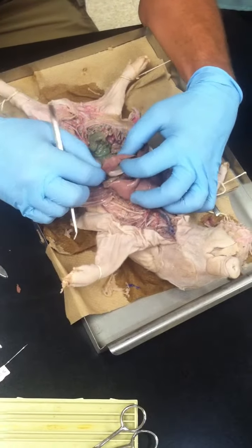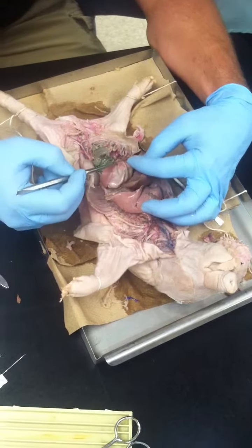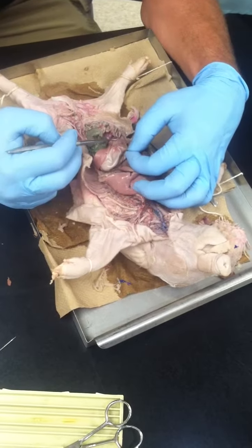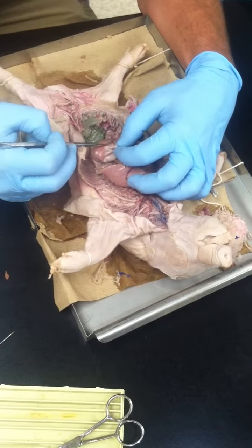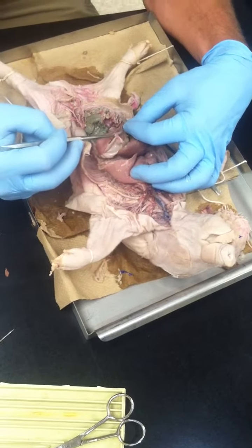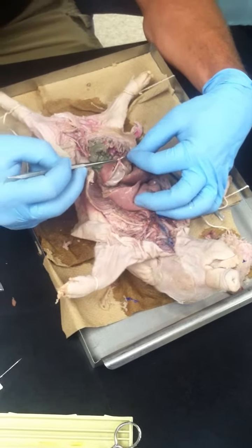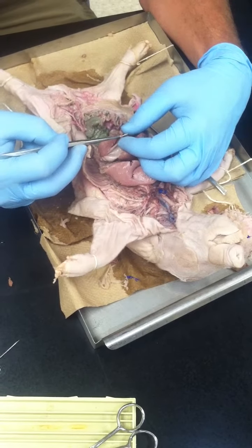Splenic, here's your spleen, coming off of that gastric, or coming off of the stomach, will be our splenic vessels. And with this one, I'll have to give some sort of description, artery or vein.